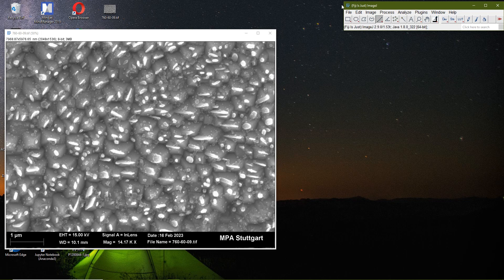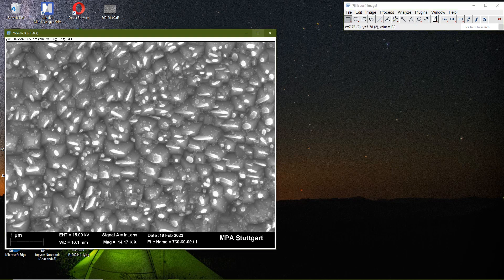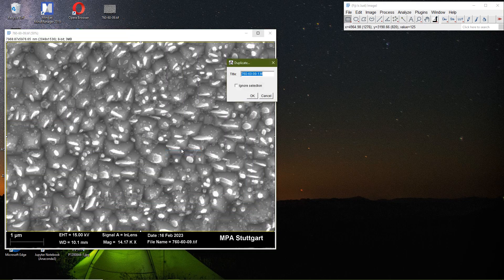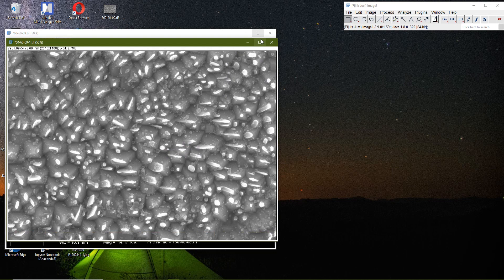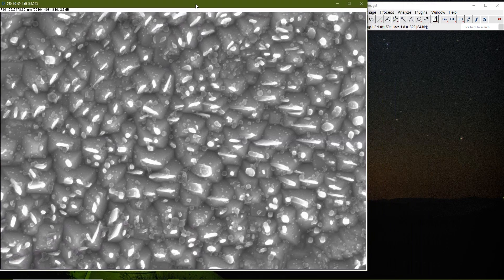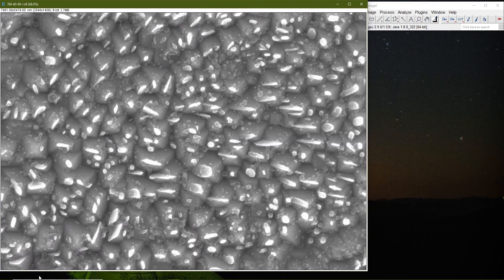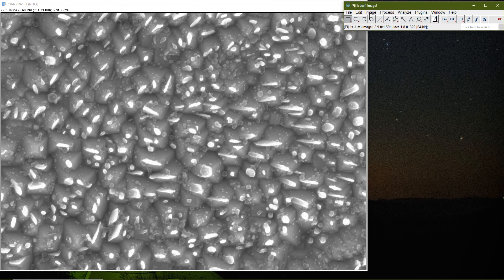Now I want to clean up this figure. I select an area, right-click and say Duplicate. It asks for a new name and I get a new figure without the lower scale bar. Whatever adjustments I do will only apply to this cropped figure, not the rest of the image. It's a way of cropping and also creating a new figure to save for later use.